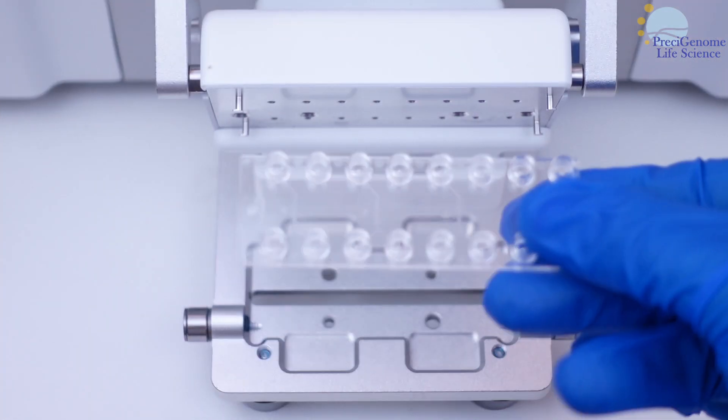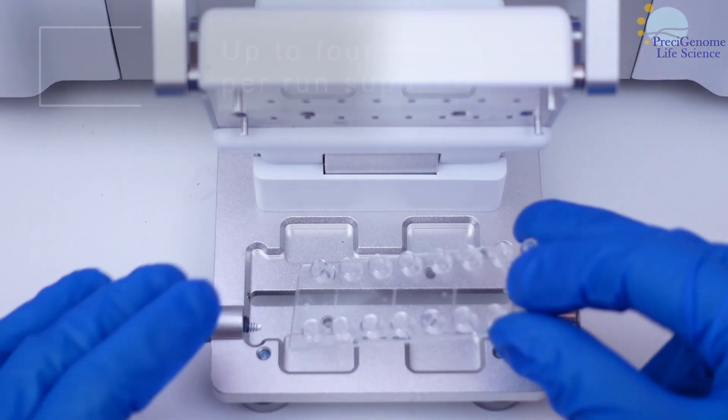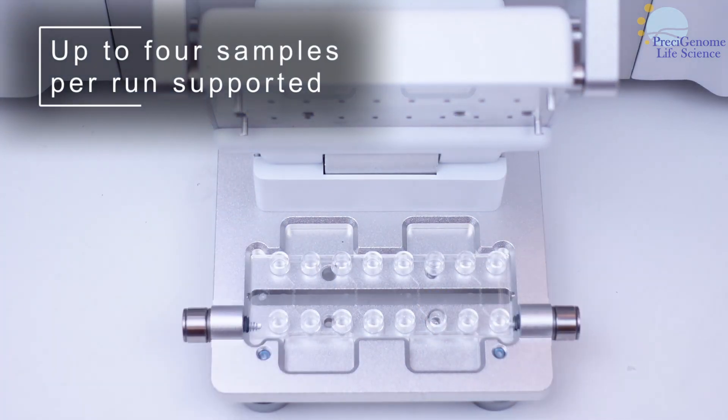The Mix 4 chip is optimized for formulation screening. Users may run up to 4 samples at once, one for each Tesla mixer channel.